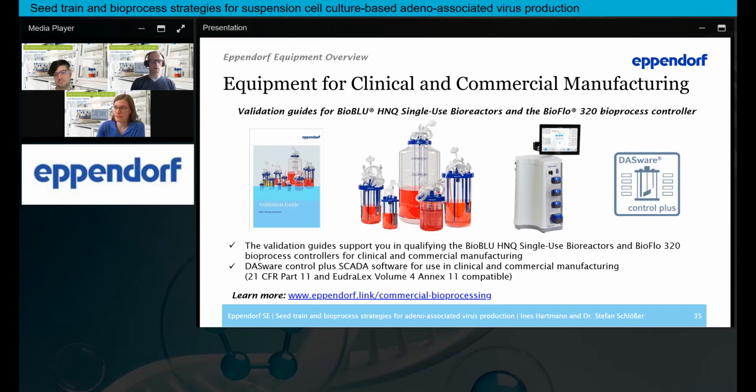The next one is regarding thawing. The question is more product related, I guess. Is your thawing block for automated cell thawing limited to certain vials? Is this related to the shape of the vials or the volume?